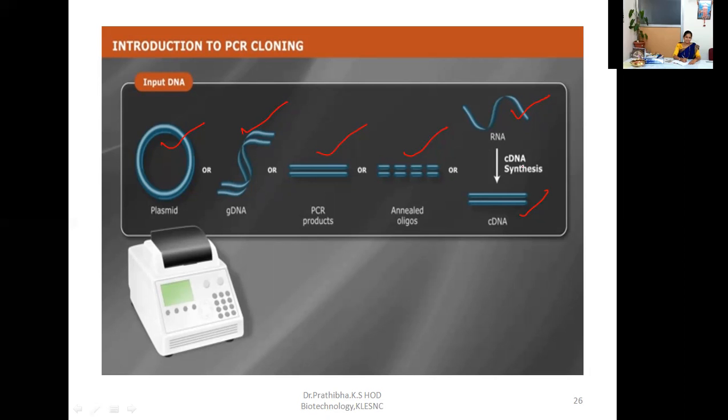It means that to detect the presence of coronavirus, lab technicians take a swab from the nasal area and also from the throat. Once they take it, they transfer it into a tube, and that tube will be further subjected to RT-PCR. We'll discuss what RT-PCR is on another day.